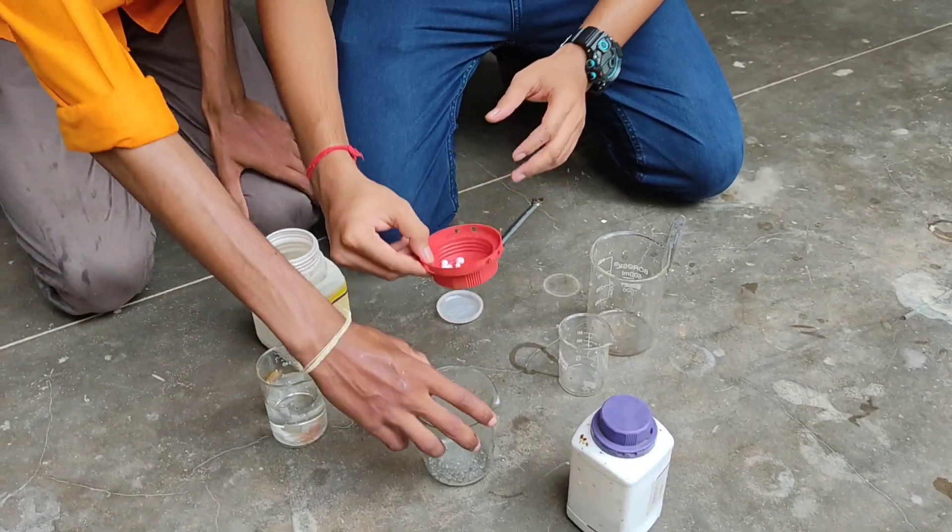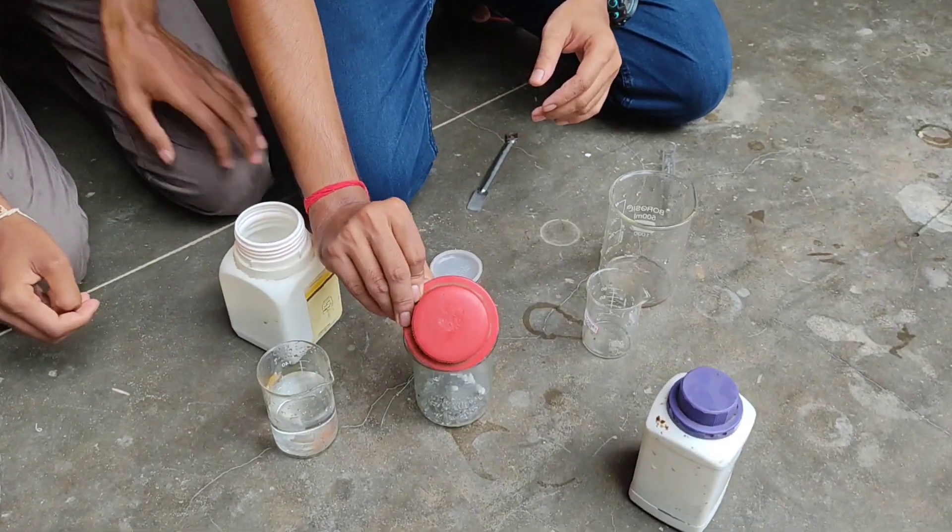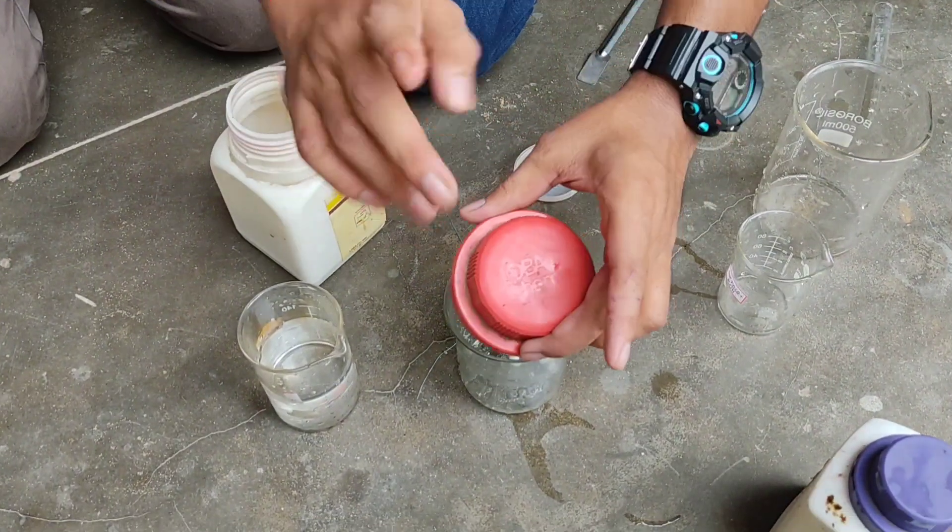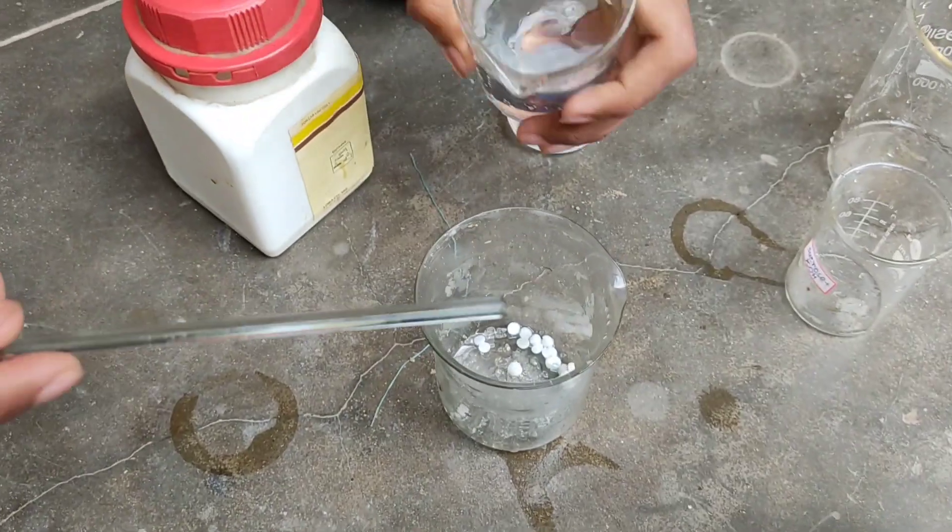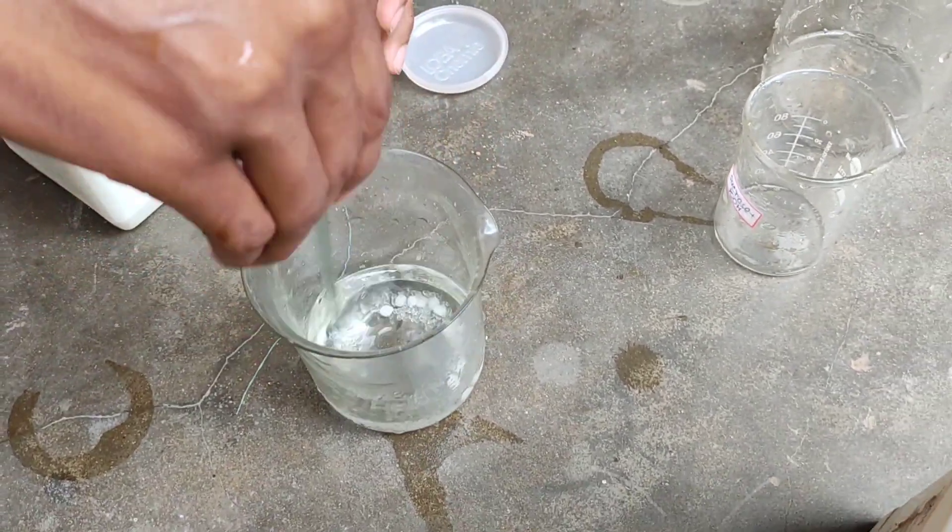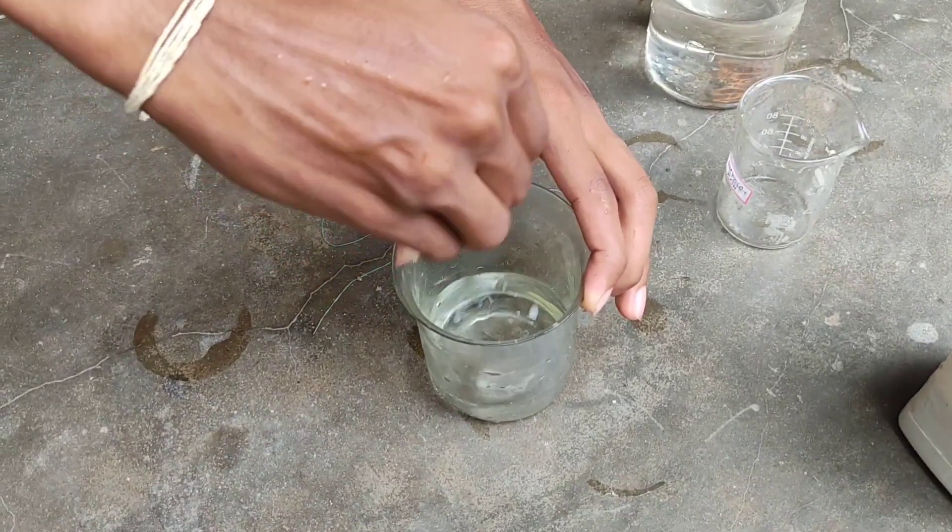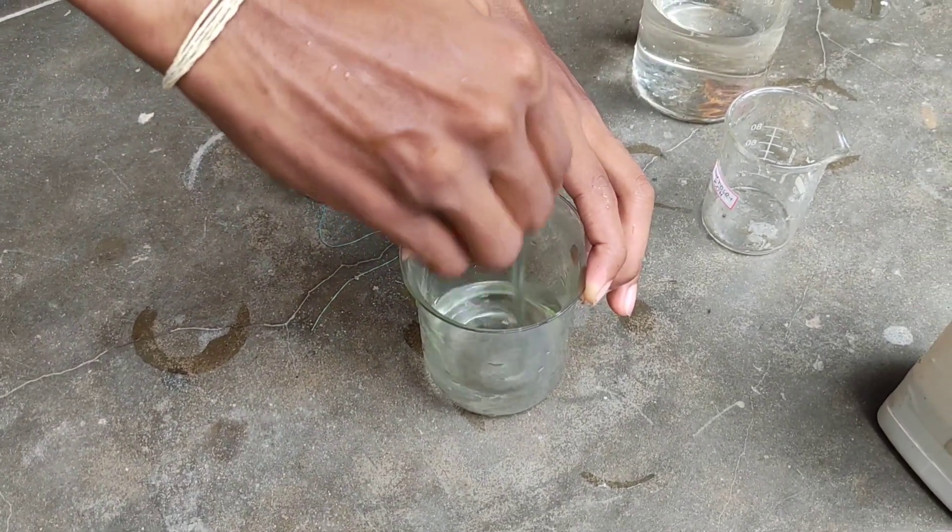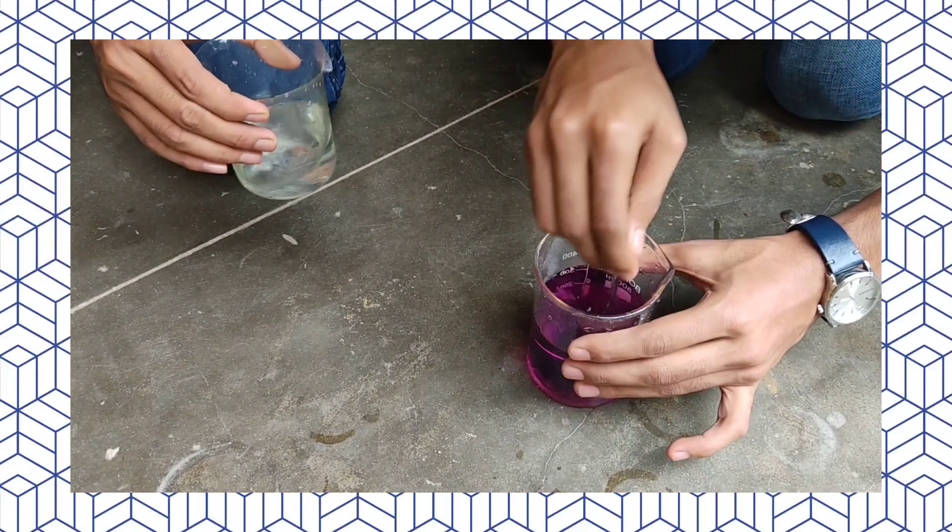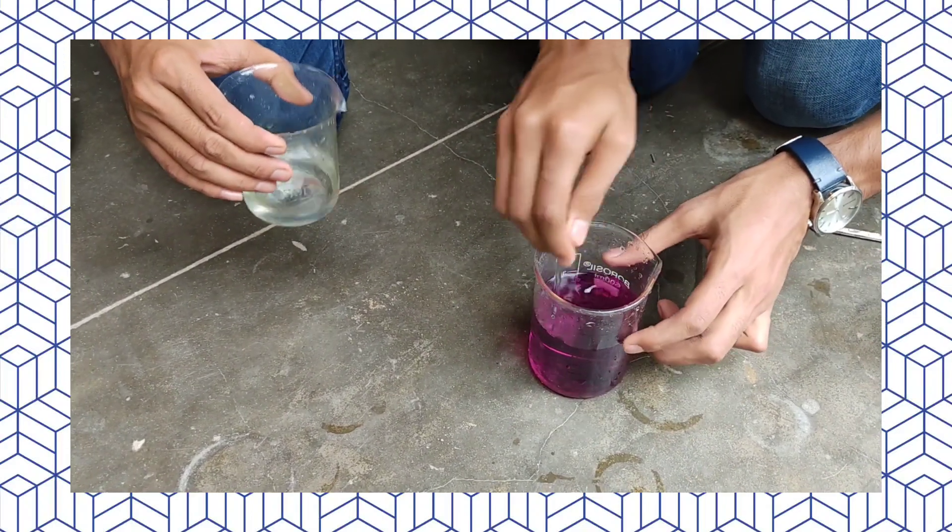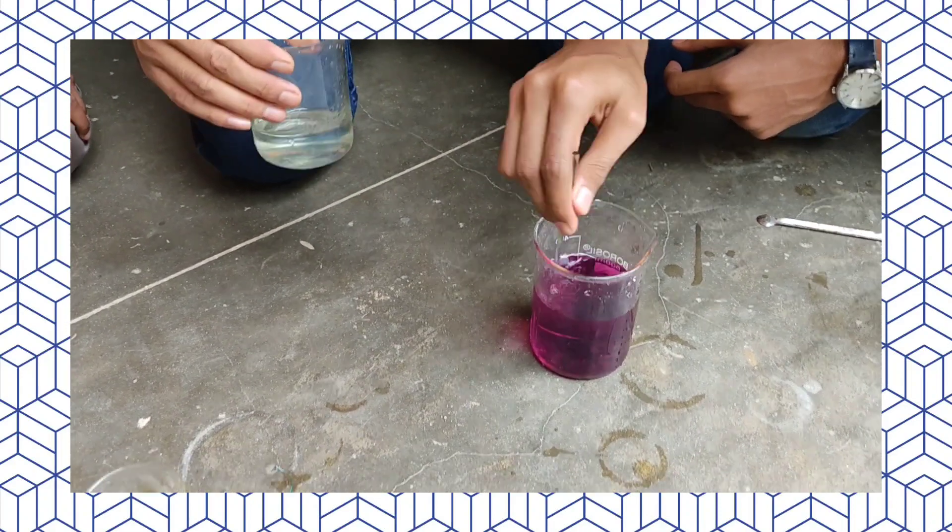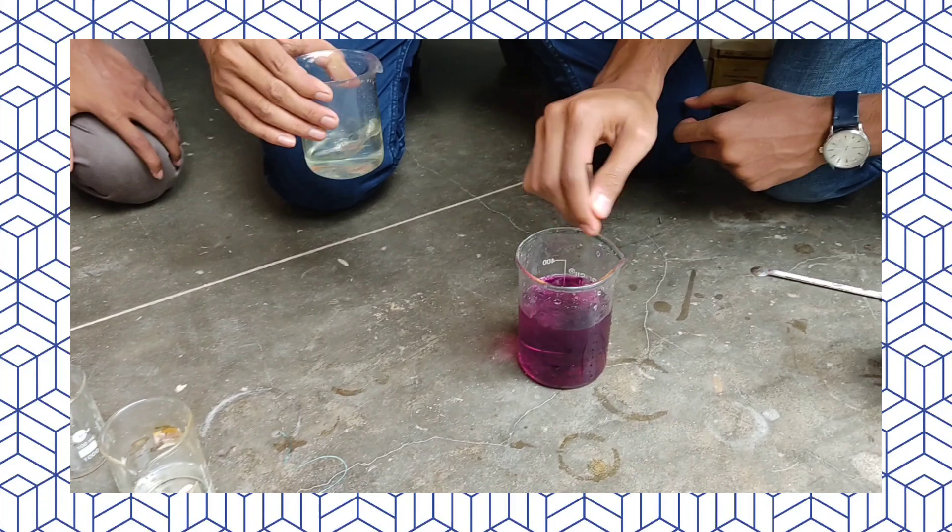In this amazing experiment, we are first adding potassium hydroxide to cane sugar and water to make a clear solution. This reaction is called chemical chameleon as it changes its color.